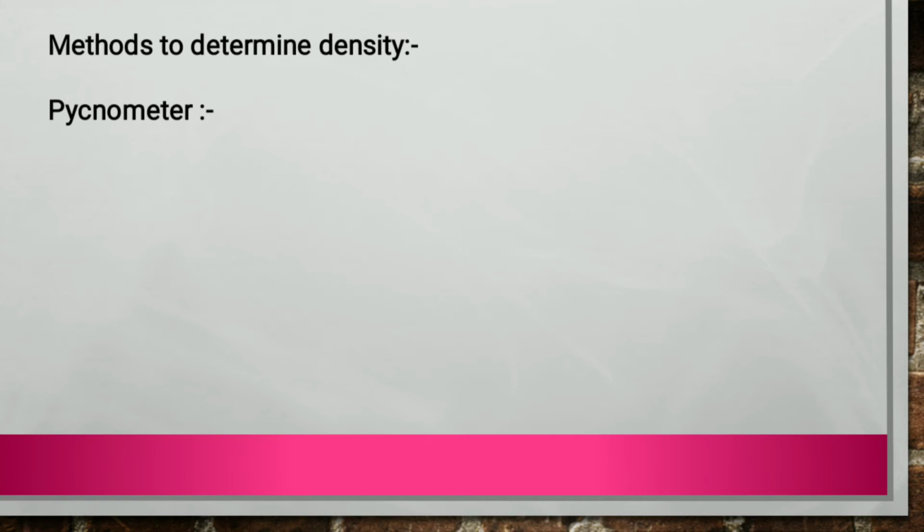Further, the instrument which is used to determine density is the pycnometer. So these are mainly a laboratory device that is used for measuring density or volume of solids. The pycnometer is a glass flask with a close fitted ground glass stopper with a capillary hole through it. The fine hole releases a spare liquid after closing a top filled pycnometer and allows one to obtain a given volume of measured or working liquid with a high accuracy.